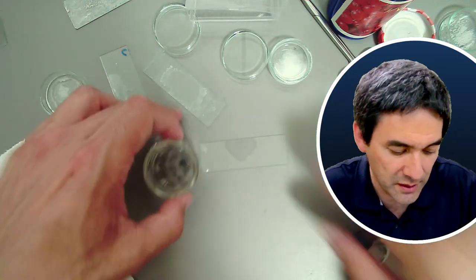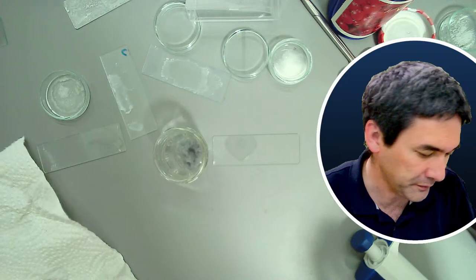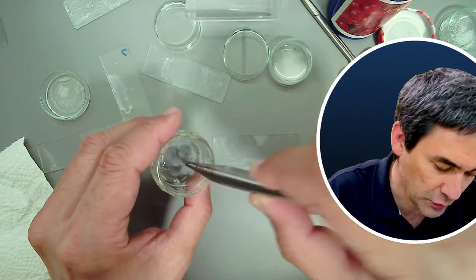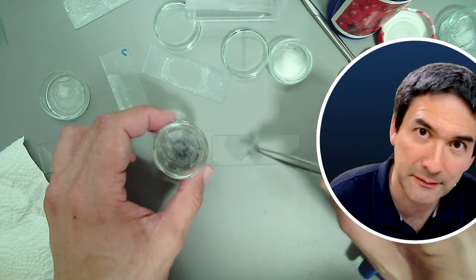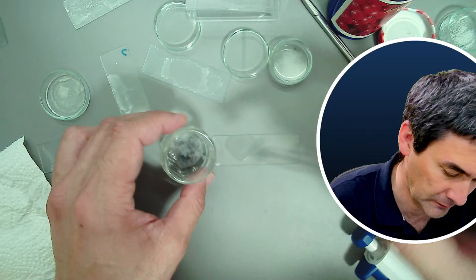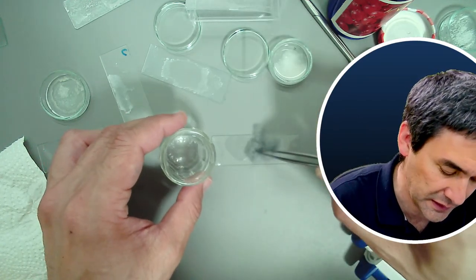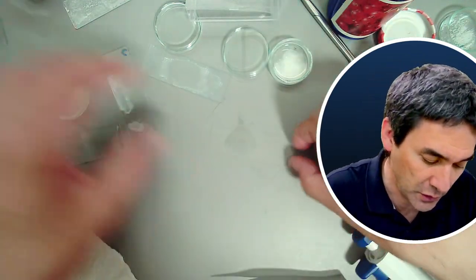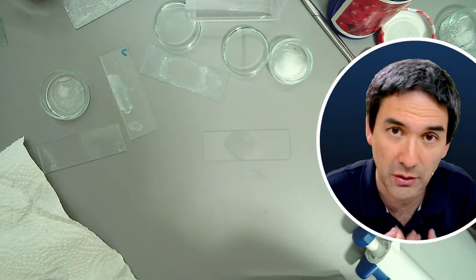I found behind my desk some house dust. Look at this, this is just regular dust, and you need tweezers. And what you do next is the following. You simply grab yourself some of this dust and you tap it. You see that there are lots of fibers on the dust, lots of skin cells. Ha, here we go with the skin cells, but also lots of fibers from clothing, for example. Yeah? And some of the fibers are synthetic.